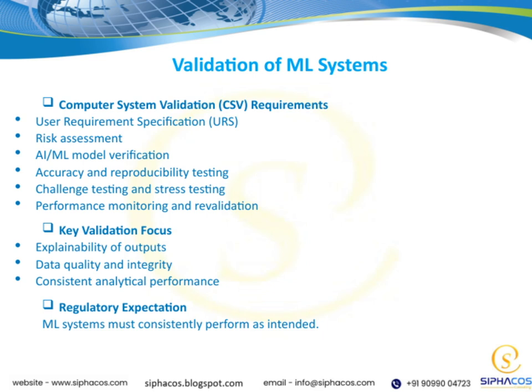Now, let's highlight the key validation focus areas. Explainability of outputs is vital. Users need to understand how the system arrives at its decisions. Data quality and integrity are equally important, as the system's performance depends heavily on the data it learns from. And of course, maintaining consistent analytical performance ensures reliability across different scenarios and over time.